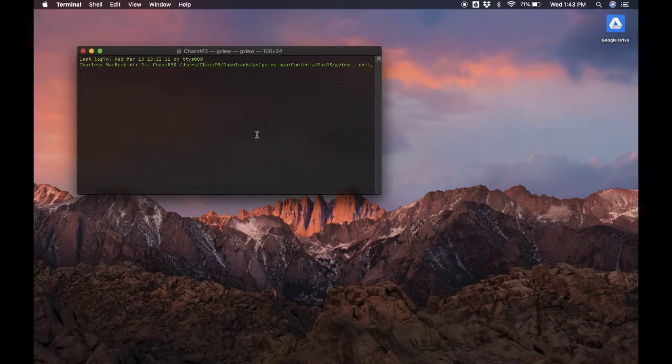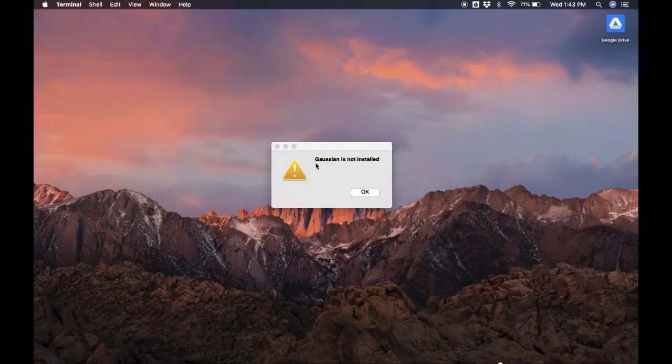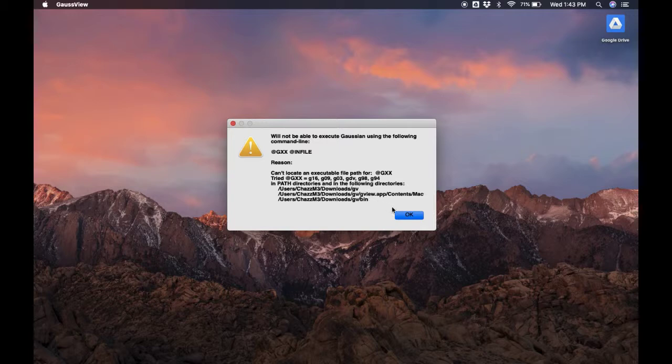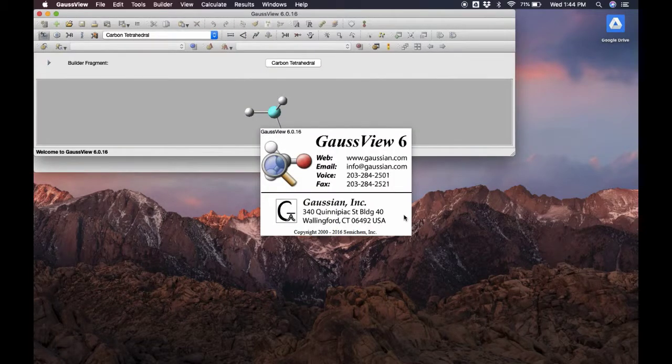Oftentimes you will get an error saying that Gaussian is not installed, and this is typically the case if you do not actually have Gaussian on your computer and it's instead being run on a supercomputer somewhere. So go ahead and click OK and ignore it.